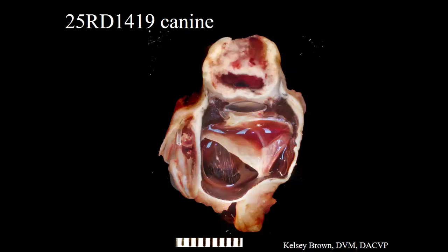All right, so there's a lot of things to point out here in this gross section. I already pointed out there is an intraocular lens in place consistent with cataract surgery. We do have evidence of our Ahmed valve in this picture. So the Ahmed valve is typically a plate that sits in the subconjunctival or episcleral region, and that's where this plate formerly was. We take it out because it does not process very well. The histology lab would be angry if we left it in. That plate then connects to this little tube. So you can see the tube protruding out here, that is going to go into the anterior chamber. So the end of the tube is actually visible right here. And it acts almost like a little shunt when the intraocular pressure reaches a certain threshold.